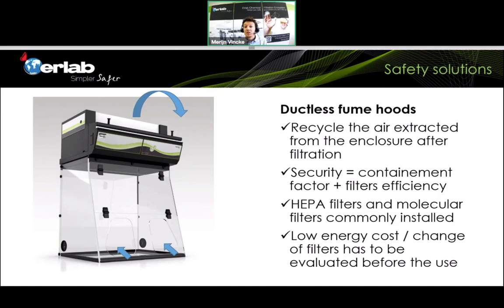So it will only use the air available already in the lab. And then you ask, of course, the question, where do those chemicals go? Where do those chemical vapors go? Well, they will be adsorbed by an activated carbon filter.